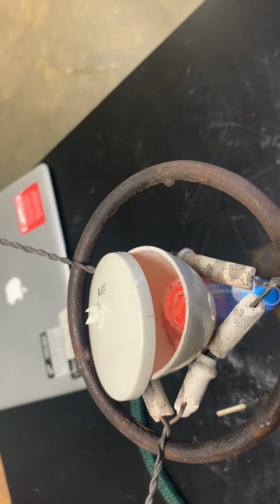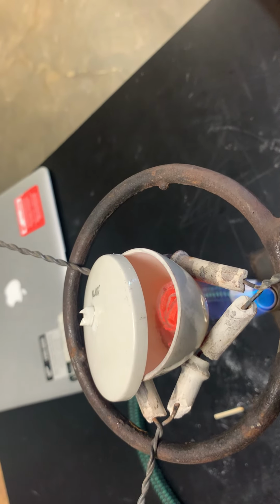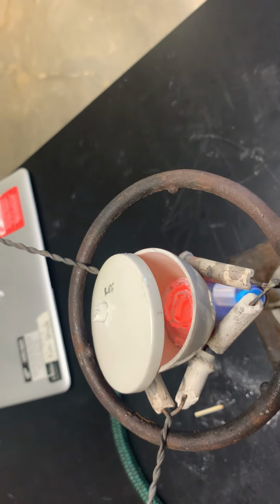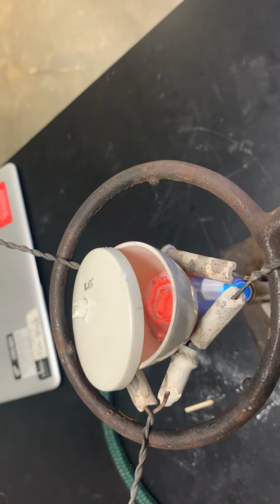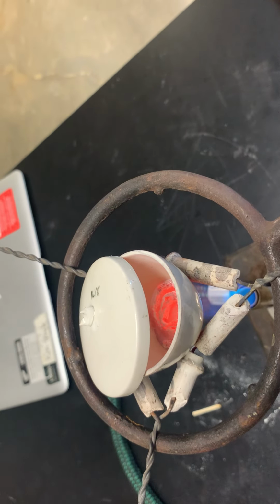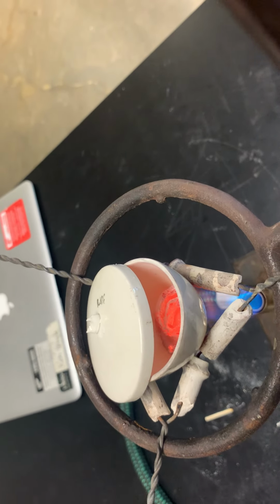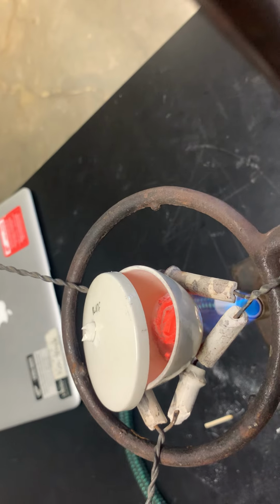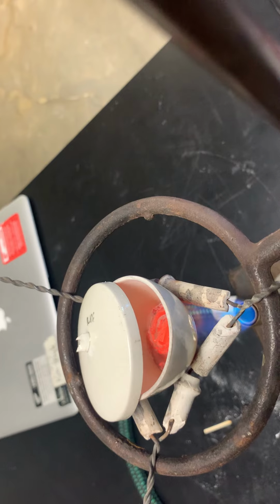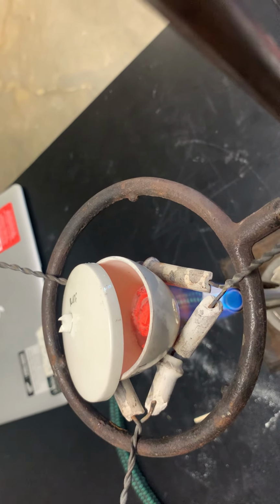And then you're supposed to let it heat and make sure that the interior also is reacting. So as long as I see that red glow, I'm going to be okay with that and let it react. So we're now supposed to wait 5 minutes for the reaction to completely consume the magnesium that's in there so that I know that when I weigh this, my result will be only magnesium oxide.